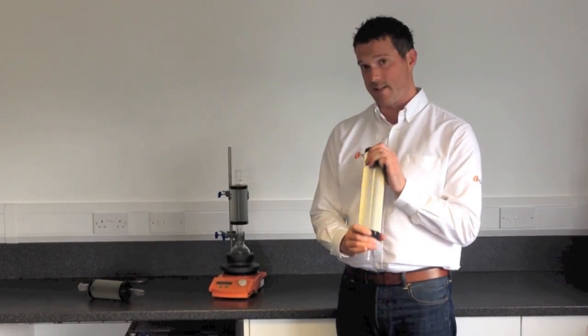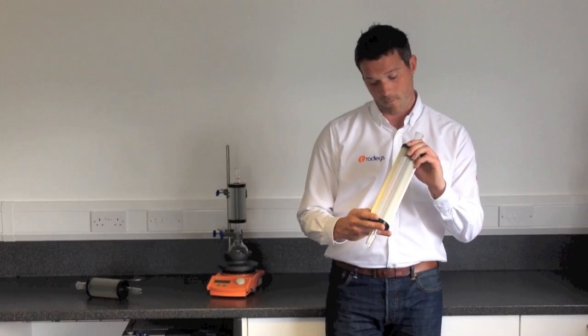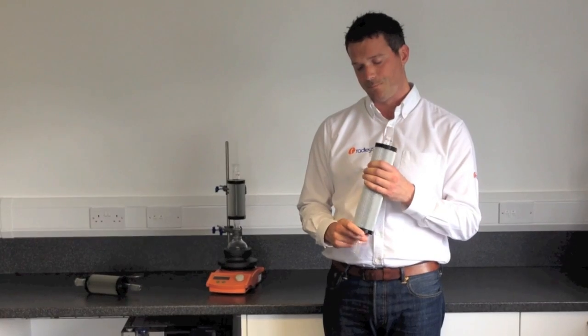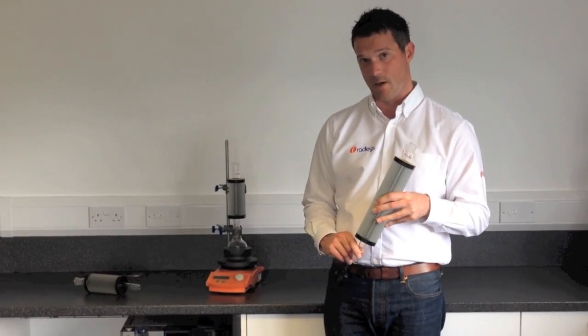This one is the standard Thindenser. It's 400mm long. It's good for a flask size up to 2L with 1L of solvent in. It comes in the joint sizes B19, B24 and B29.